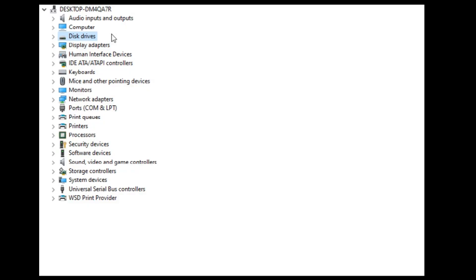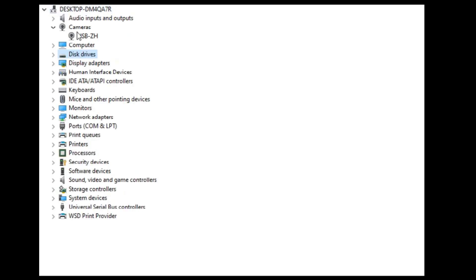I'm launching Device Manager to make sure the camera shows up. Here it is under 'Cameras' as USB-ZH. Before launching Theramino, make sure the camera shows up — it's possible the name will be different from USB-ZH.